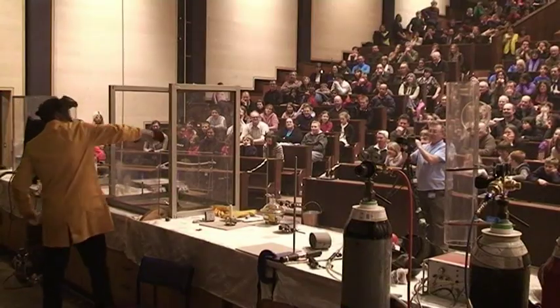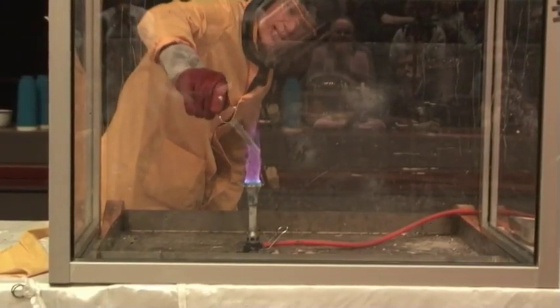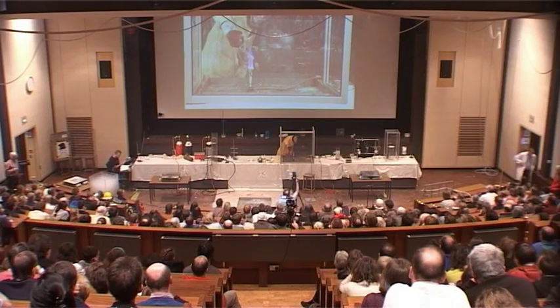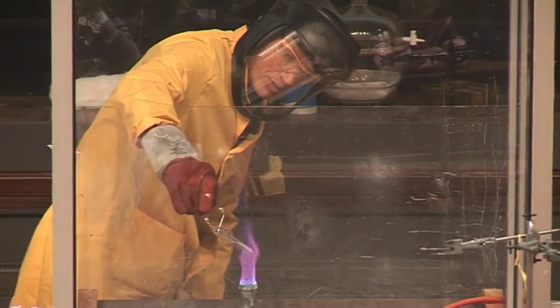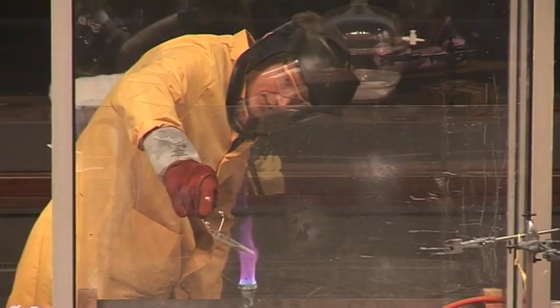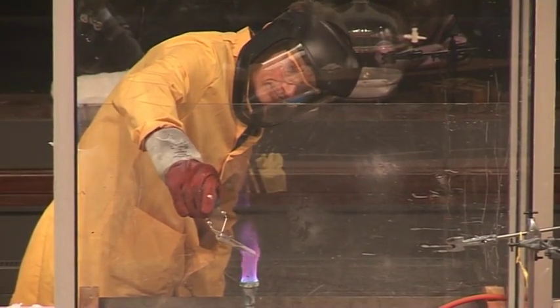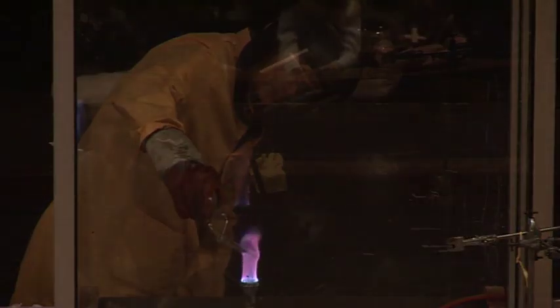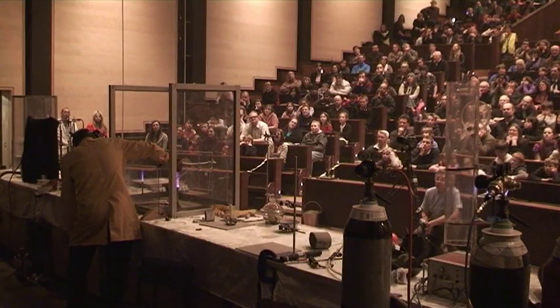Okay, now this takes a little bit of time for the reaction to start, before the magnesium burns. And we're trying to see if burning magnesium reacts with sand. Okay, so I say this will take a little bit of time just to get it hot enough. But once it's hot enough, we want to see if there's any reaction. Okay, so warming it up. It's beginning to go.